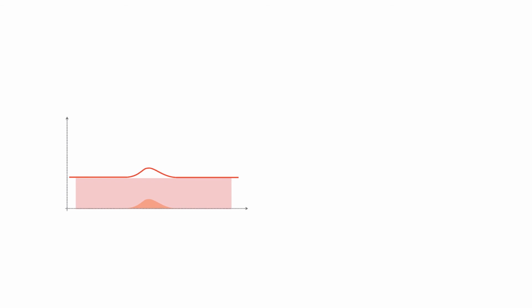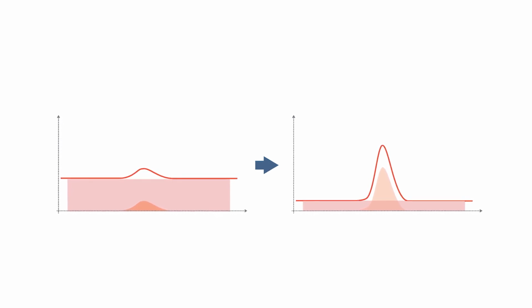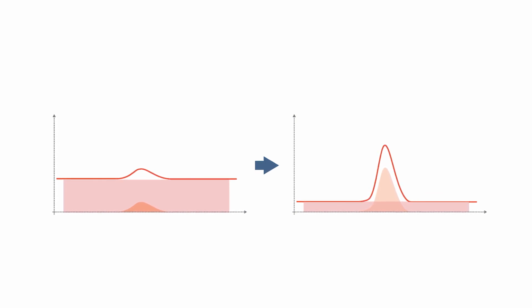Knowing these digital imaging basics can help you improve image and data quality. Maximizing the signal, minimizing the background, and optimizing the sample condition are essential elements to improve data quality for any application or experiment.